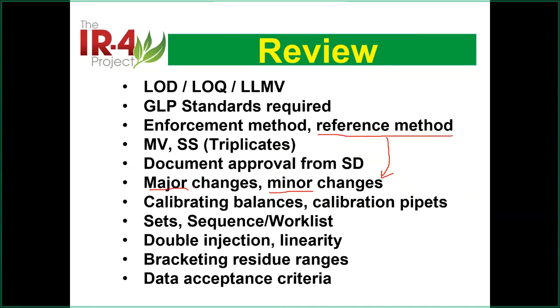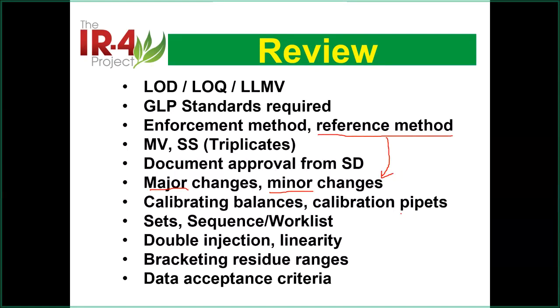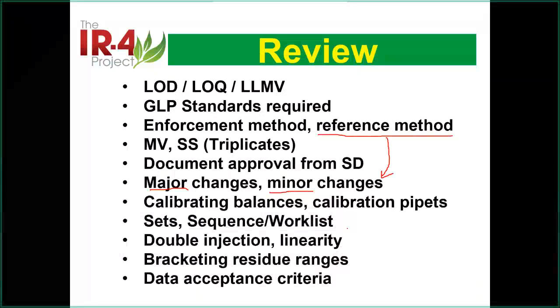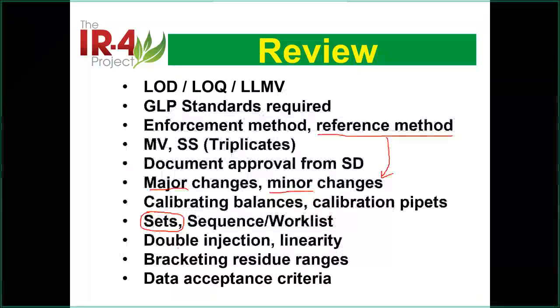Then we showed some photos of how you do the balance checking and pipette checking. It all depends on your SOP and the requirement of the work, so you should do that accordingly, but this is the GLP requirement. Then we talked about the definition of a set. What is a set? What's the requirement? What samples must be in there?